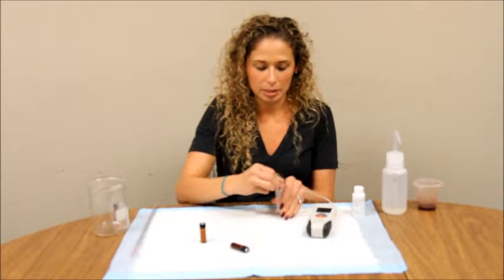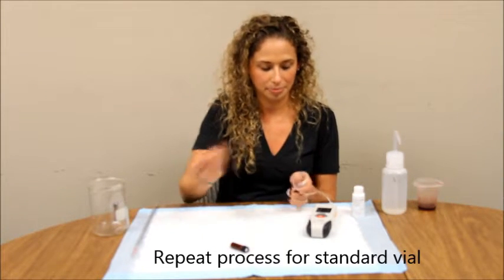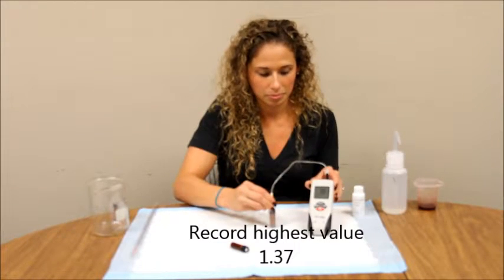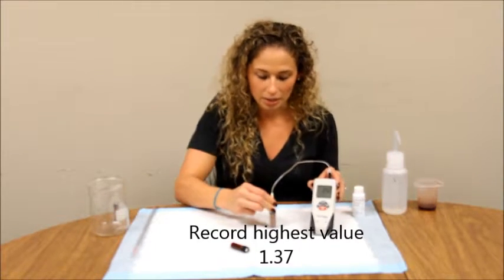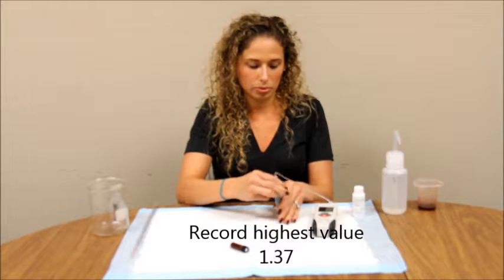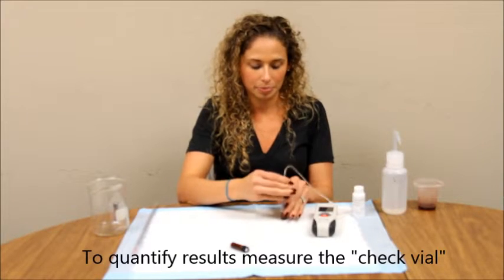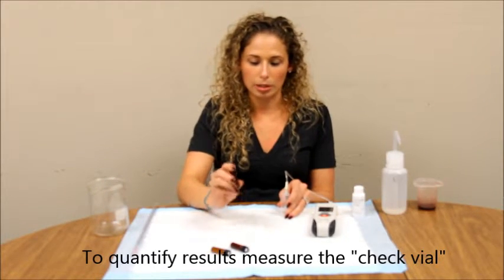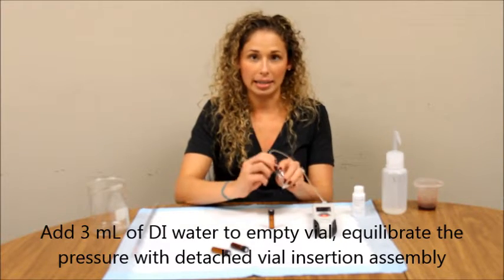Now repeat this process for your standard vial. If you are quantifying your measurement, you are going to need to measure a check vial as well. Make sure you equilibrate your check vial before taking the reading.